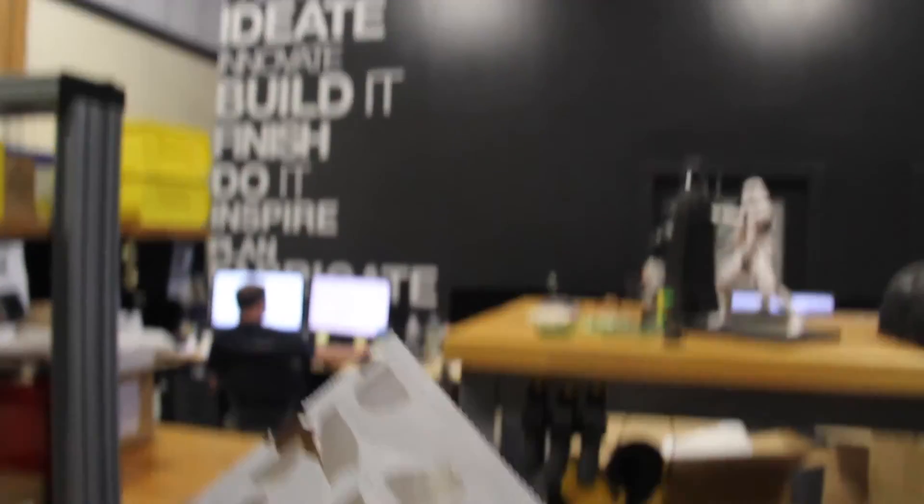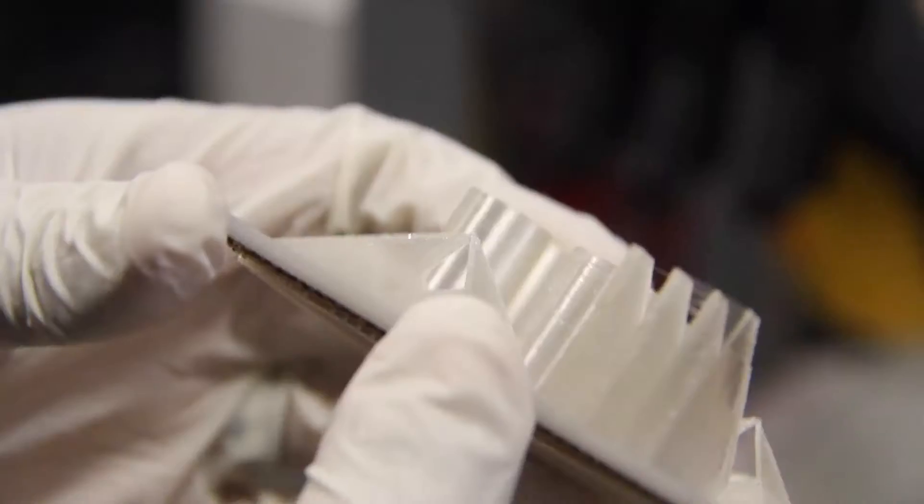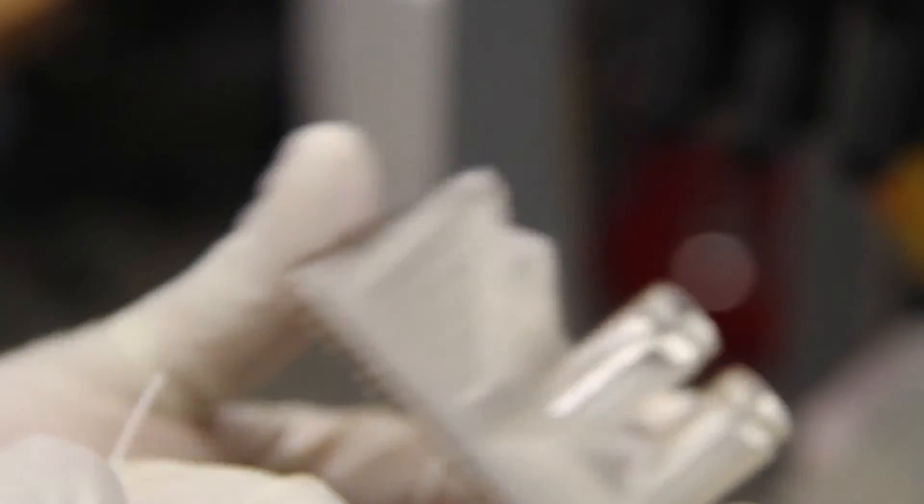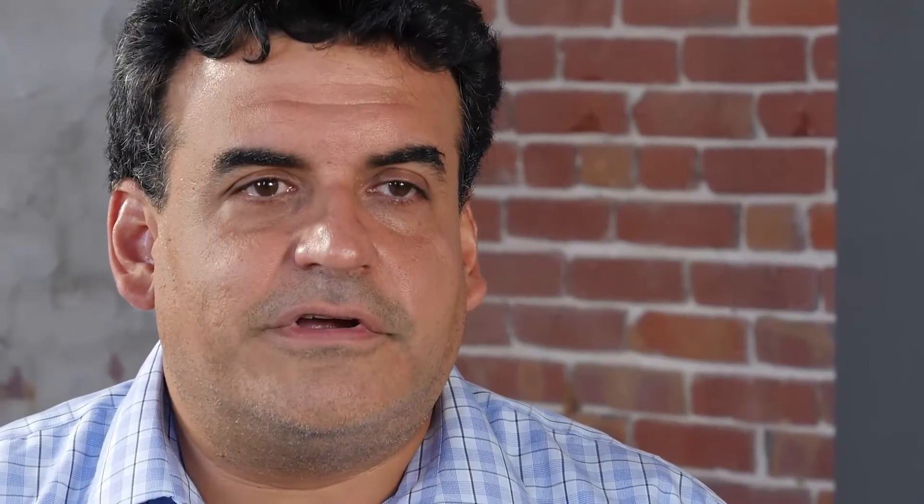The bill of materials is about 20 parts and is a fraction of what would be in a conventionally made incubator. A conventional incubator would easily have several hundred different parts inside of it and also involve a lot of assembly work.